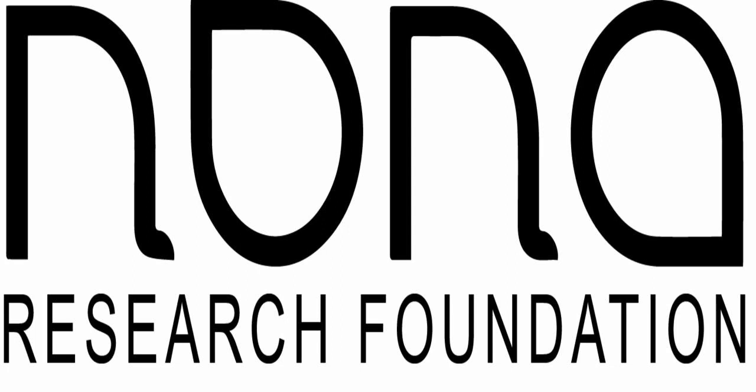Let's kick off with some of the introductions to our Nona Talk LIMS during fall of 2022, where we're going to be discussing a little bit of the requirements around LIMS, what makes it good, what makes it bad, some of the headaches that people have had in the past.